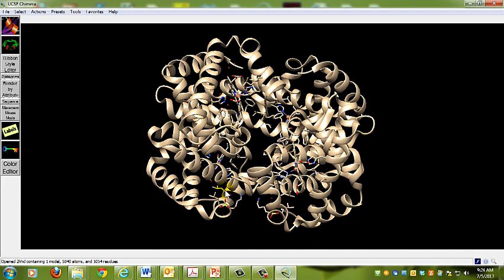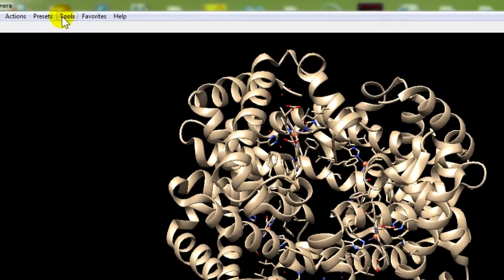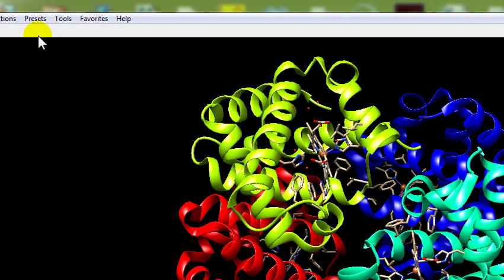Fast and easy, no trouble at all. I didn't even have to go to the protein data bank website and search for it. As I mouse over this, you can see this is lighting up alanine 82 and C. That's alanine residue 82 counting from the amino terminus in the C subunit. You can't tell there are any differences in the subunits here, but if I go to presets and interactive ribbons, they automatically change to various colors.